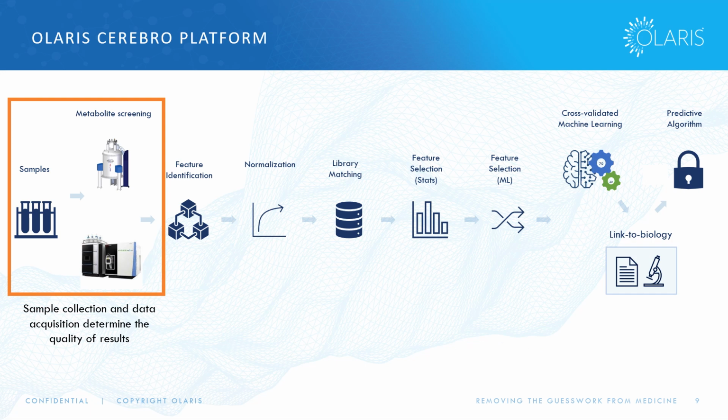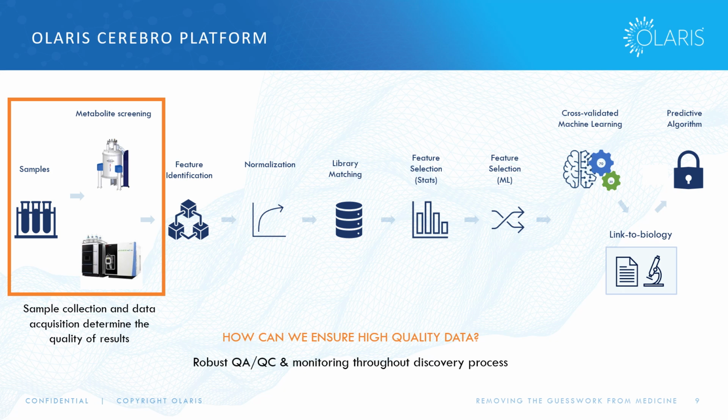In addition, the fundamental part of this is the beginning. As I said, the data that you put in will influence your results. So sample collection and data acquisition will determine the quality of your results. Therefore, it's key to ensure the high quality of your data. And how do you do that? With robust QA/QC, as mentioned, and monitoring every step of the way.